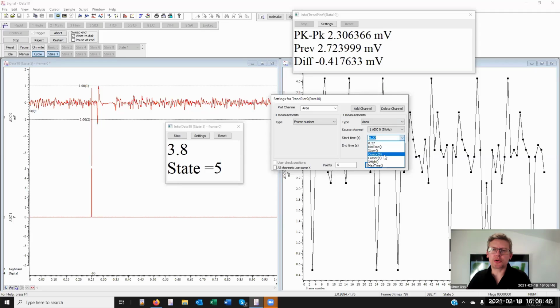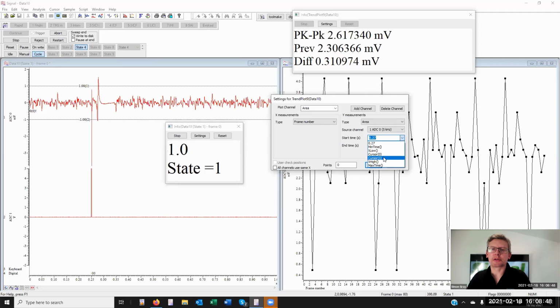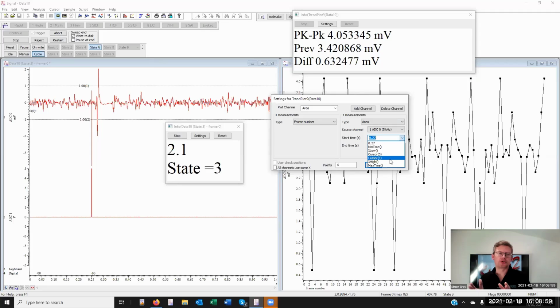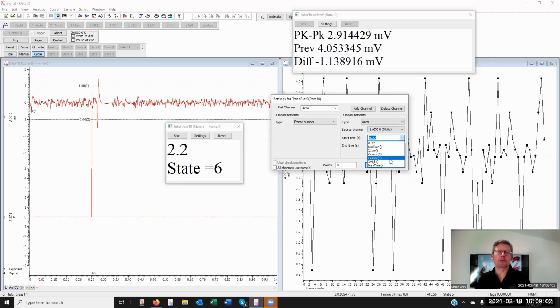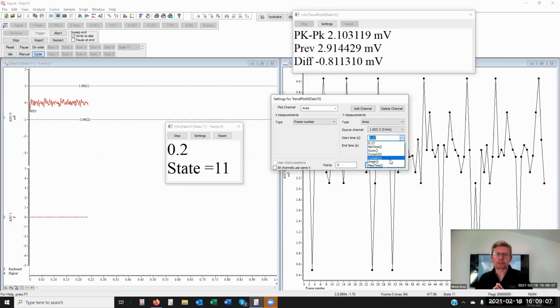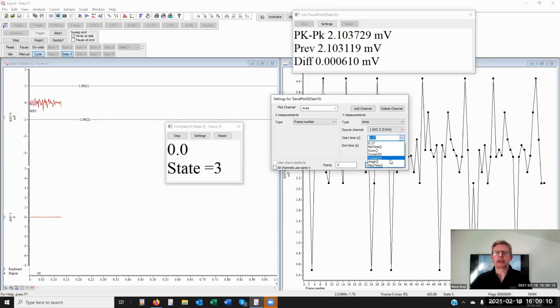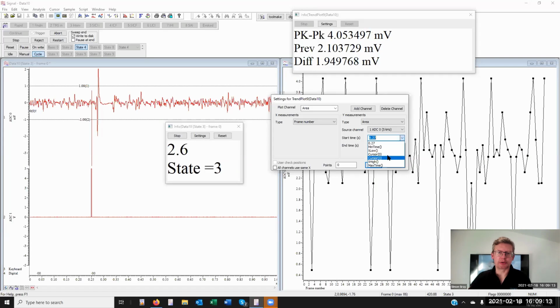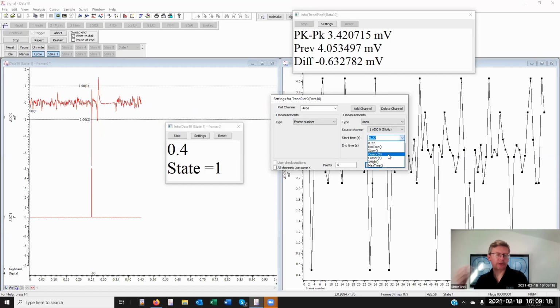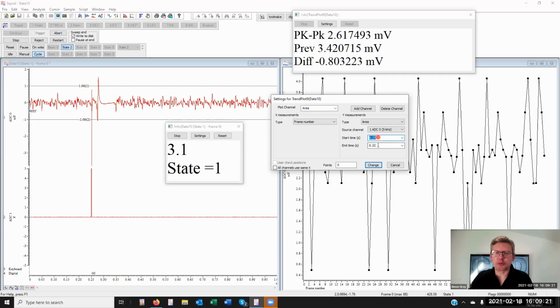Or in fact, these could be linked to cursors. And that's going to become more and more important. So if we're starting to use active cursors, these vertical cursors in the first instance will move out to say peaks and troughs and other major features of the waveform, perhaps percentage repolarization. Those then represent times for us. And we can use those in this dialog, as in cursor 0 and cursor 1, as positions, moving positions per frame to obtain the area measurement. Now, I'll stick with the same values here for the time being.